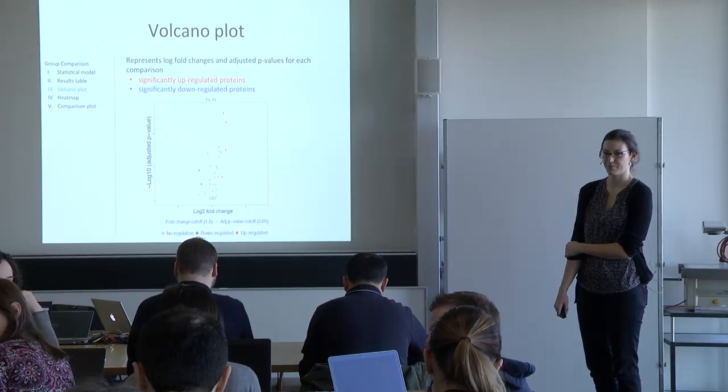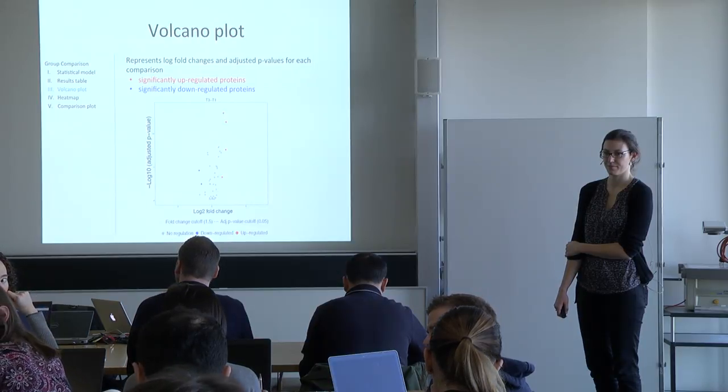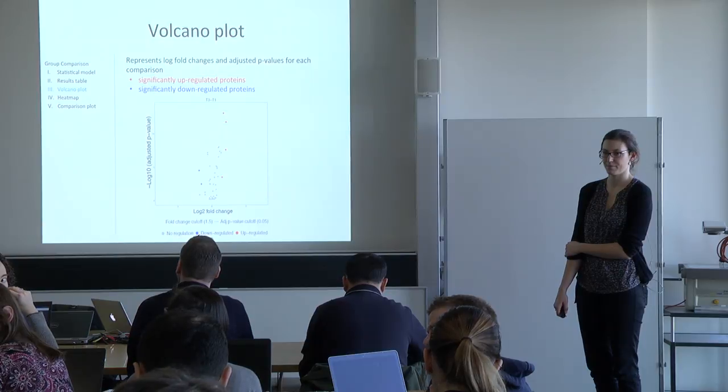I would like to ask regarding the same comment. Once you have a truncated peak, which is unreliable, but you know that the intensity is somewhere in some range, that is much better than having 0 for p-values, because that would be NA. But if you know that's not an NA, then your p-value doesn't suffer that much. Is there a way to account for this?